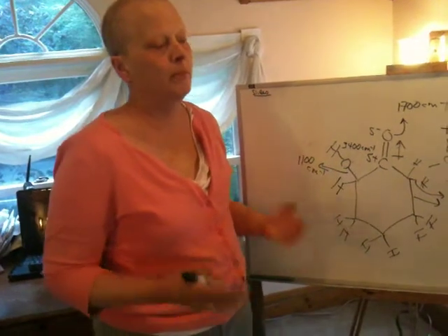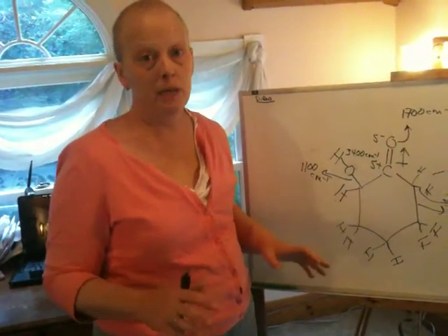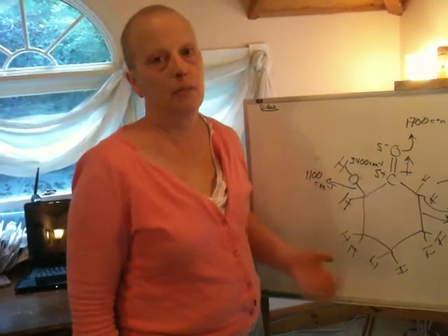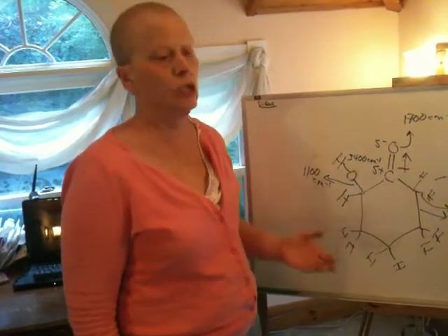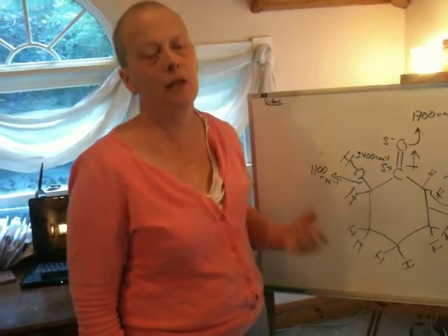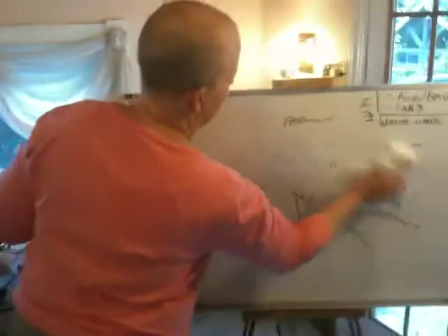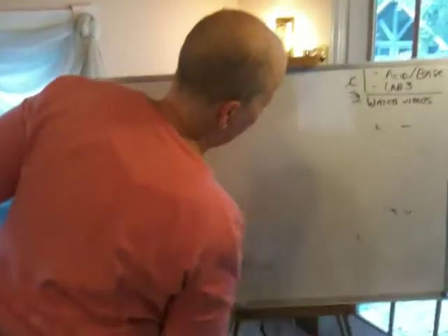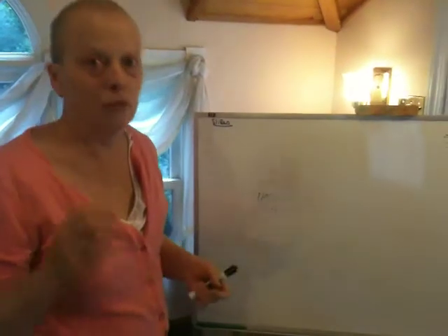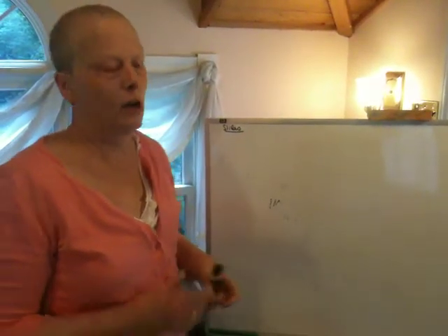And similarly, chemists really look at these spectra from an image standpoint to some extent. I certainly don't sit wailing away with tables and numbers all the time. A lot of times you can just look at something and see what's going on because it has a very characteristic landscape, and that's what I want to teach you. Now, I'm going to show you 3 compounds, or 4 maybe, and you're going to be pretty good at landscapes right off the bat. So I'm going to show you what certain functional groups look like in the IR.